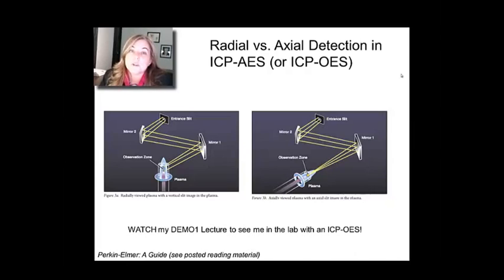And as you'll see, we're measuring chromium in that case, and rather than just looking at one wavelength of emission, we actually have it tuned to several. And that's actually one of the ways in which AES can be a better quantitative instrument than absorption spectroscopies, because you can actually get a lot of different wavelengths, and by collecting all that data simultaneously, you can get much lower random error. So that's another advantage that you'll see with atomic emission.